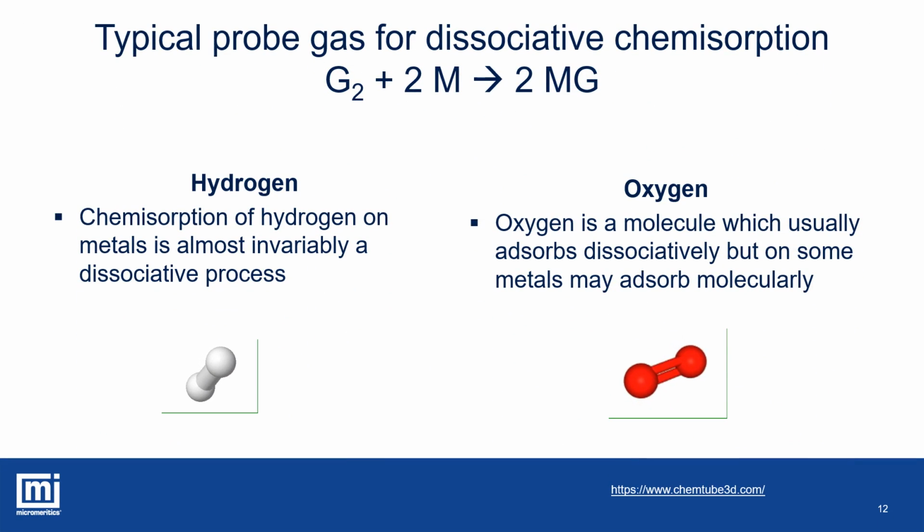Let's see in detail the most common adsorbates used in chemisorption experiments. Hydrogen is the most used gas for chemisorption measurements. It is frequently used to analyze platinum, rhodium, iridium, and the noble metals of the group 8. Hydrogen cannot be used to characterize silver and copper, and it forms with palladium a solution that is a function of the temperature and pressure. Generally, hydrogen is adsorbed in a dissociative form, but many other mechanisms of interaction with active surfaces are known, like spillover, bulk adsorption, or dissolution and reversible chemisorption.